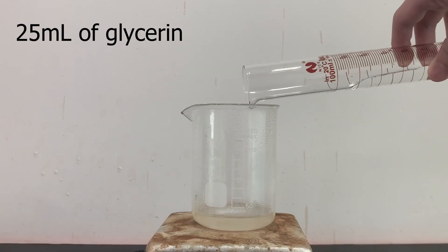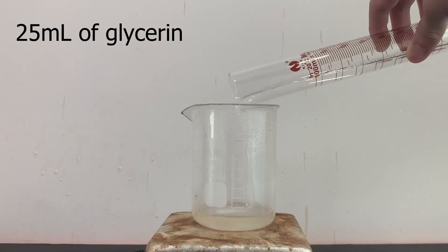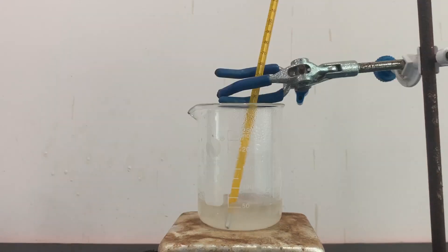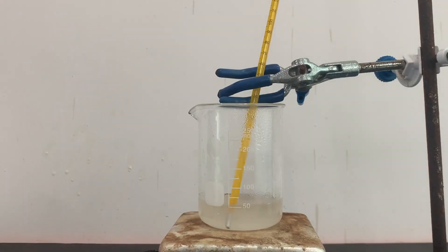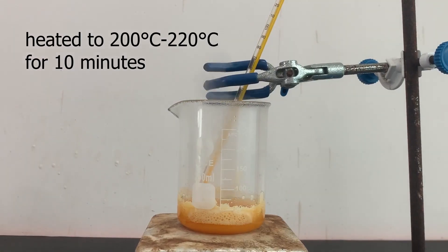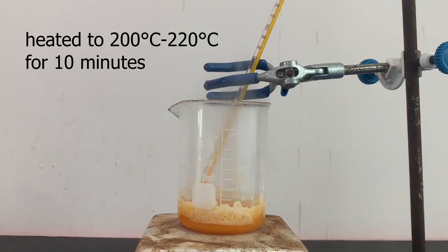When everything dissolves, 25 milliliters of glycerin is added. I then heated the reaction mixture to boil off the water. I continued heating the reaction mixture to 200 degrees Celsius, but I made sure that it doesn't go above 220 degrees Celsius.